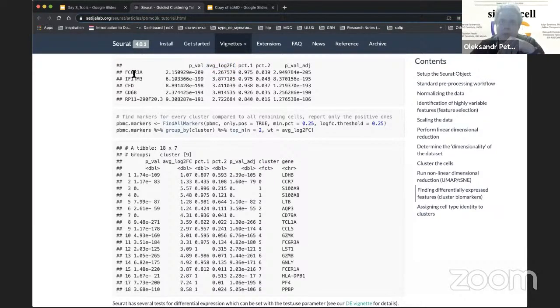There are actually a few very interesting comments regarding the adjusted p-value versus the usual p-value, considering the sample size. And yes, I think you're absolutely right. The adjusted p-value is already included in the standard output of such functions, because it's really more valuable for us here. Yes, I agree. Also, because they correlate, I was picking the incorrect p-value.